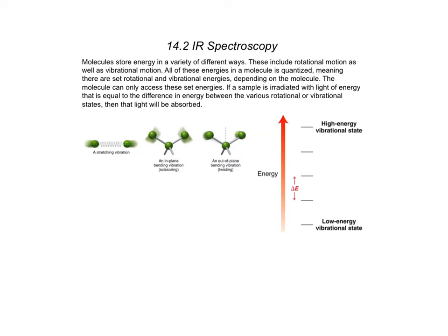One thing I do need to note is that really the only thing we're going to take away from IR spectroscopy is the type of functional group that is present in a molecule. These various stretching frequencies are going to be very indicative of functional groups. What do I mean by functional groups? The ones affected the most are the bond that is affected. Give me just a common functional group.